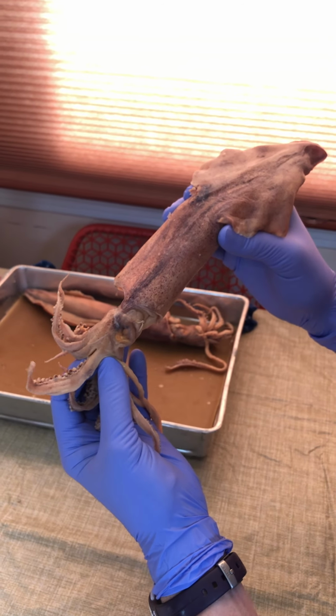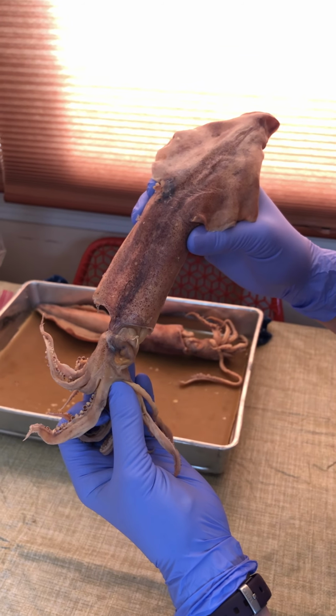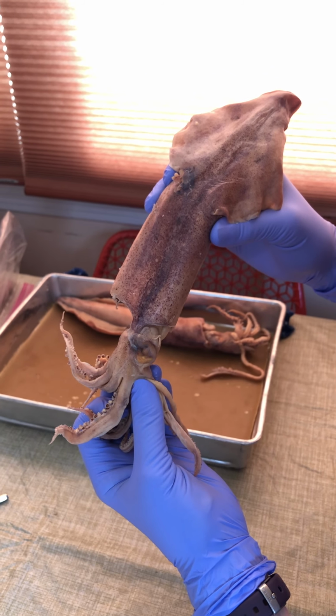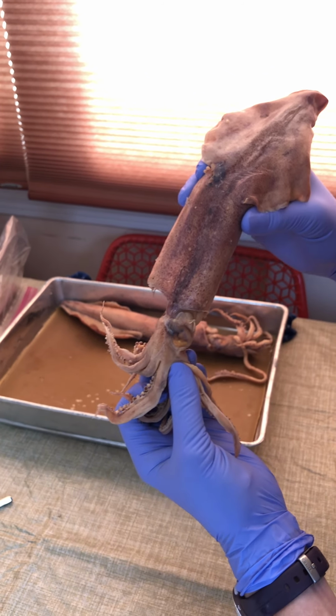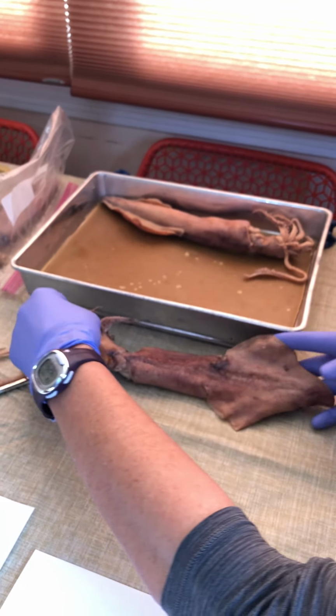So let's do this, okay? To try to figure out how these axes work, we need to see how they develop from the generalized molluscan body plan. And there's a couple of drawings down here that'll help us do that. So I'm going to put this down, and we're going to look at these drawings.